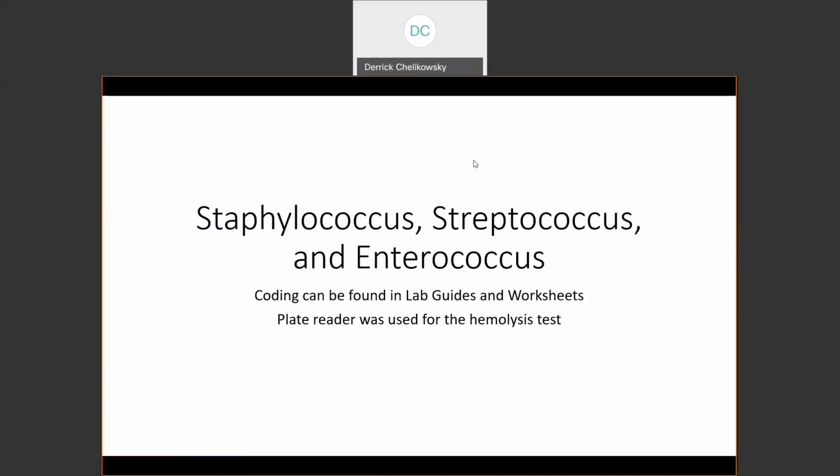Hello everyone, today we're going to be going over this short video. We're basically looking at some of our tests. This is the first in a series of 3 tests for Staphylococcus, Streptococcus, and Enterococcus. The base video you should already have watched on YouTube. This is an extension of that, looking at our pictures and how we would go about identifying exactly what it is we're looking for on these plates.